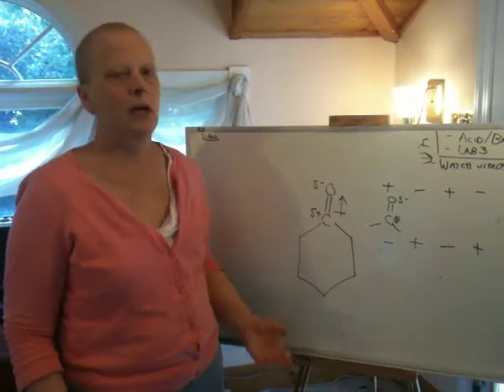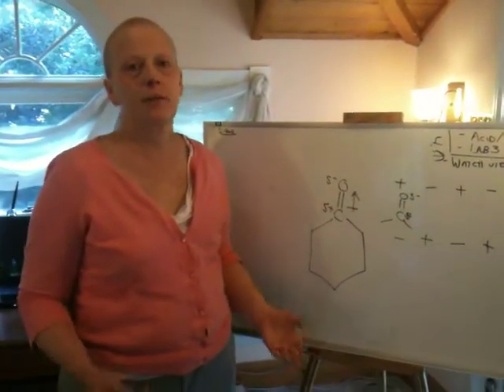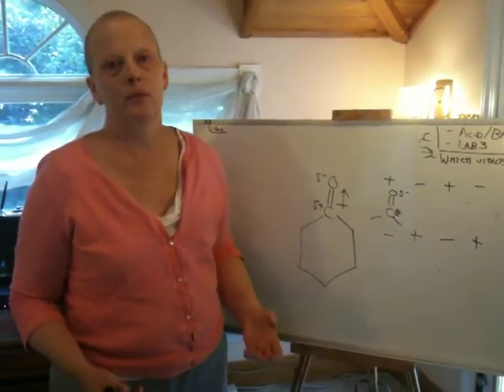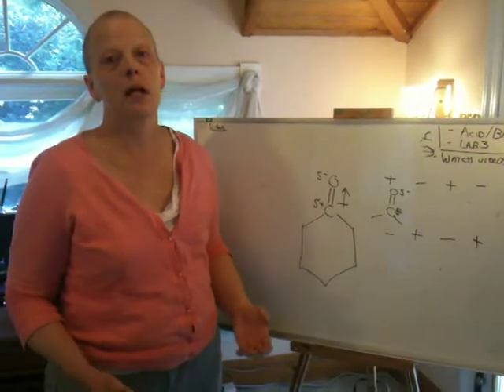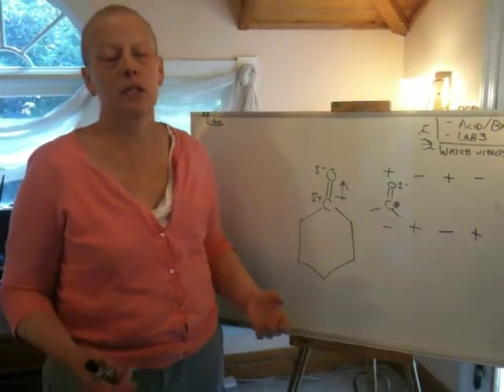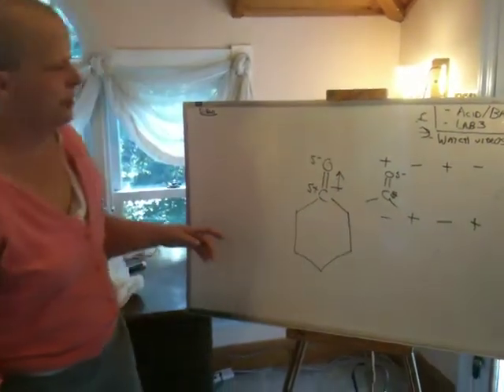However, CH bonds are not very polar, and because they're not very polar, they don't really individually have big absorptions. However, really polar bonds have huge absorptions. So a single carbonyl in a molecule or a single OH bond in a molecule has a huge absorption. And that's what I want to show you here.